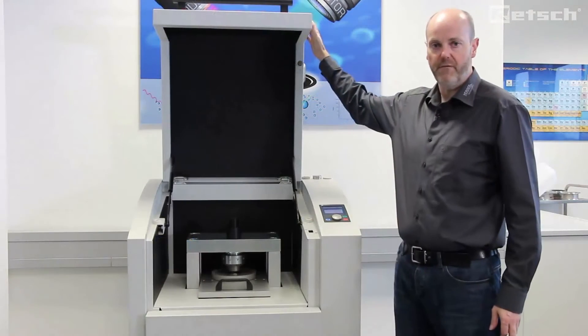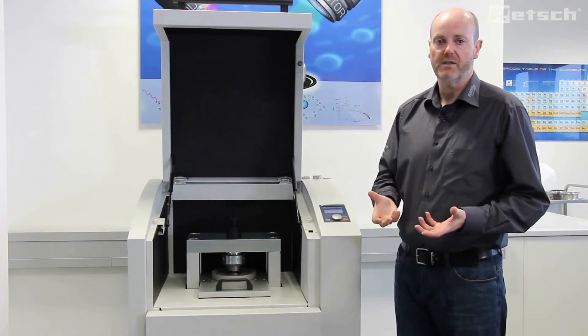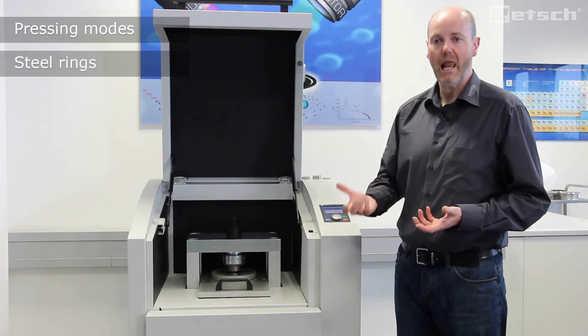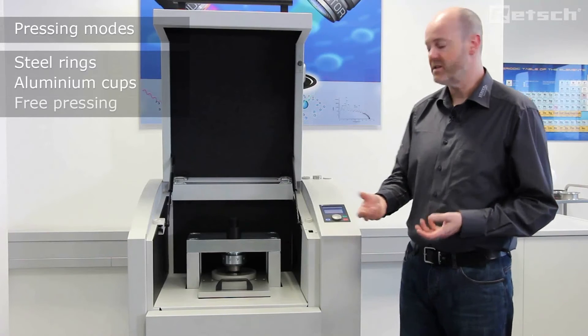The PP40 can accommodate pellet pressing in three ways: either in steel rings, aluminium cups, or in free pressing.